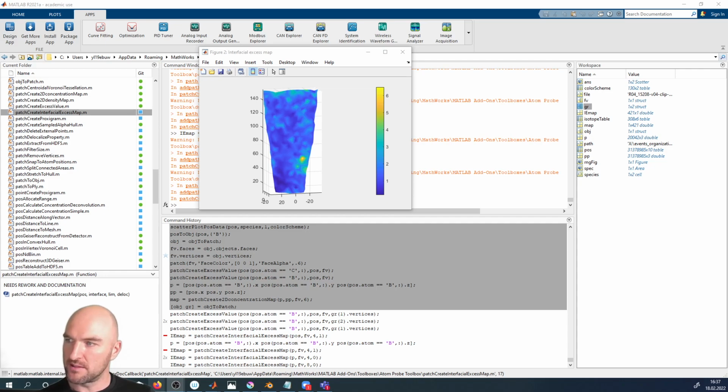And what is the frequency of toolbox updates? Yeah. So if you have anything with the toolbox that's going wrong, just shoot us an email. We will set up a bug tracker on Git, so that we can track the bugs, and also a version registry. Now we haven't had versions up to now, but I think now we're going to do versions so that you can always say, okay, I was working with version 1.05 or whatever, and we can find any problems if there are problems. And of course, if you have set an analysis setup and we change some functionality, that you can still use the old functionality.